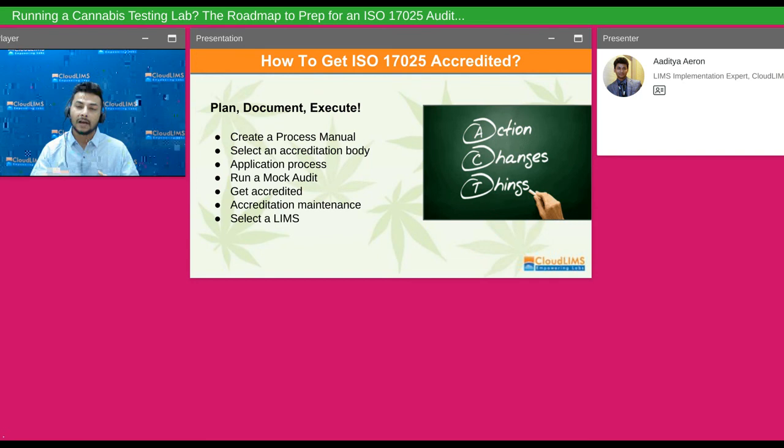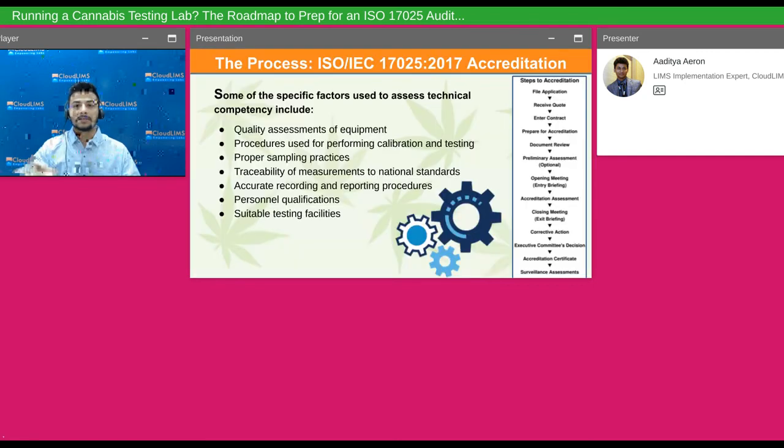So actually, ISO 17025 gives you a window of about 1 year also, so that you can maybe plan and apply and then execute, and then you can get better at it and finally receive an award certificate for that. So your first step actually becomes to lay out your entire plan and then pull in all the pieces of documentation that would be utilized, and then finally select the right set of software, run mock audits internally, apply for the accreditation and win it, and then maintain it.